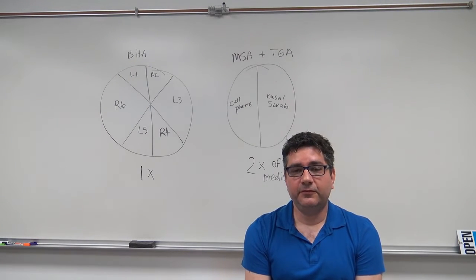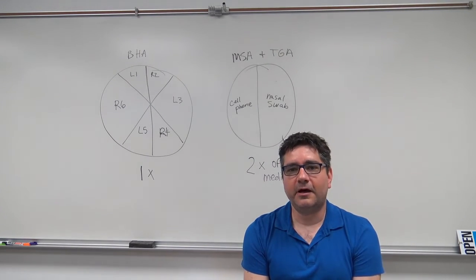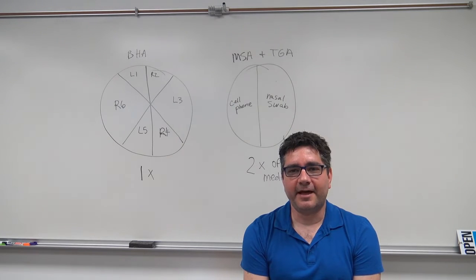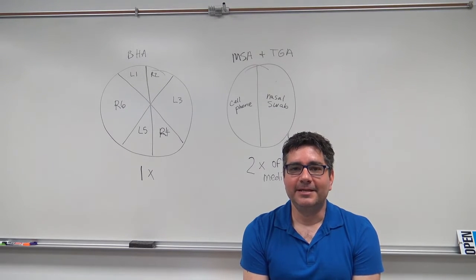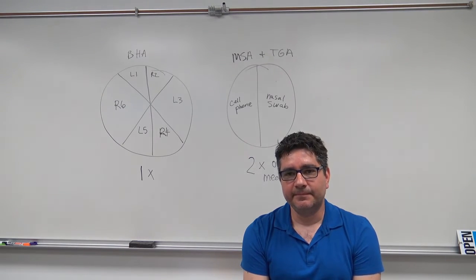The first of these two mediums that you will be using today is mannitol salt agar. Mannitol salt agar contains a high concentration of salt, which makes this medium selective for staphylococci, but also contains mannitol that, when metabolized by pathogenic Staphylococcus aureus, produces a yellow color in the medium, differentiating it from non-pathogenic staph species.